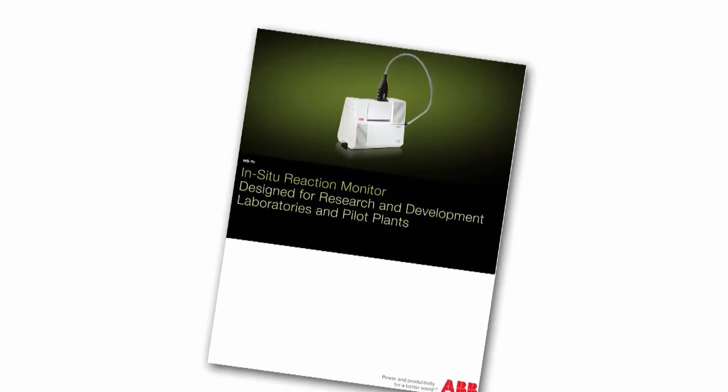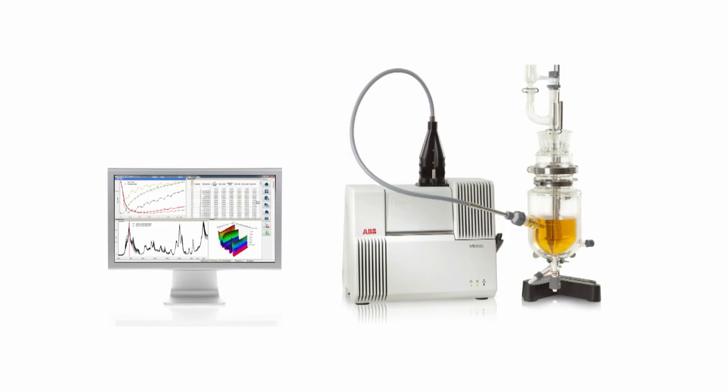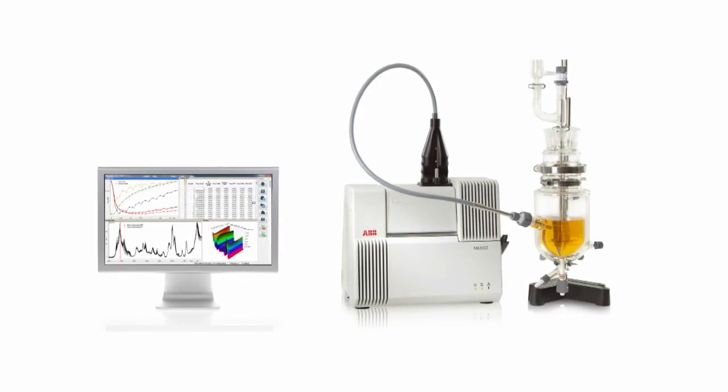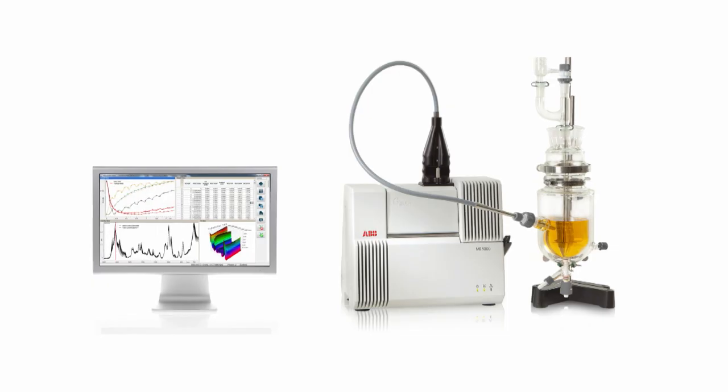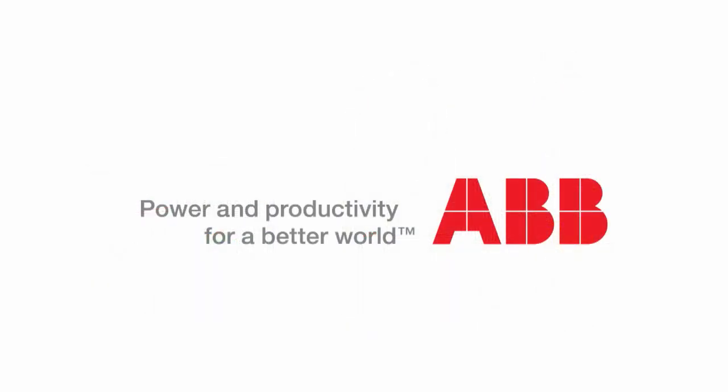This solution perpetuates the reputation of ABB analyzers in terms of their analytical excellence. ABB MBRX Reaction Monitoring Made Easy.